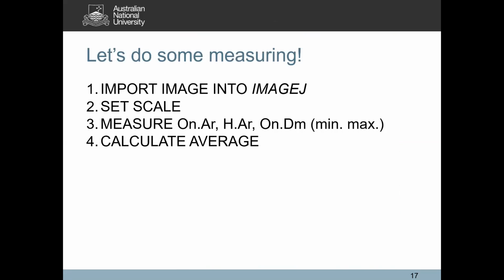Okay, so what we're going to do now is just do some measuring. I'll show you a couple of very basic tools that we use, and feel free to follow what I'm doing and do it yourself, or again, do it later in your own time. We're going to follow the same procedure we did last week: importing the image into ImageJ, setting the scale, measuring the variables, and then calculating averages.